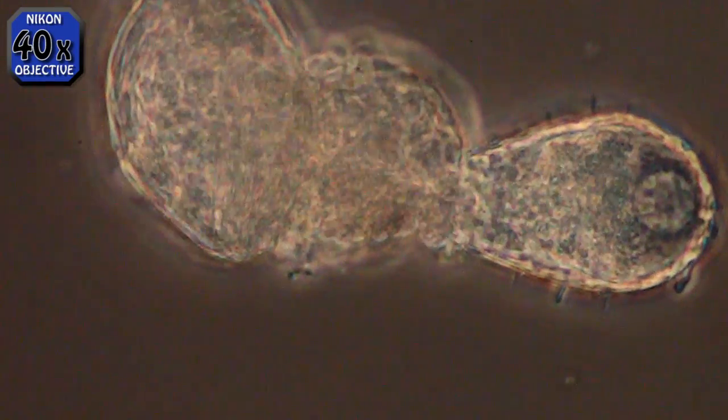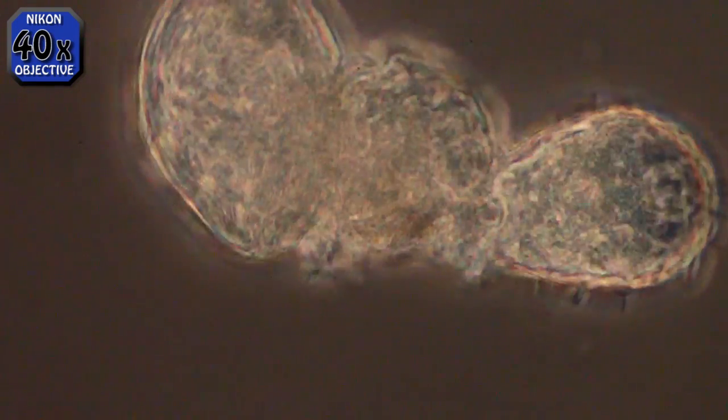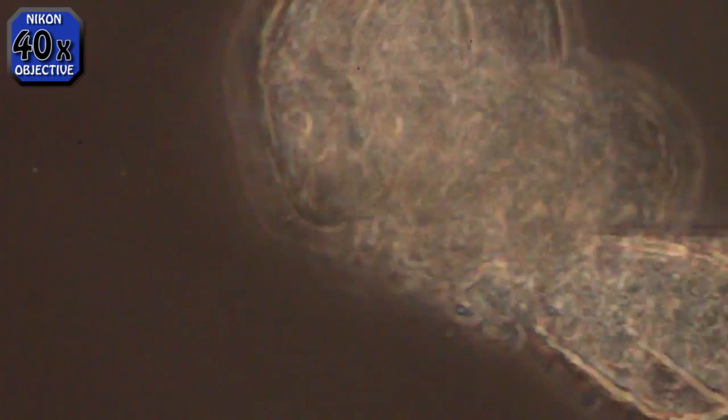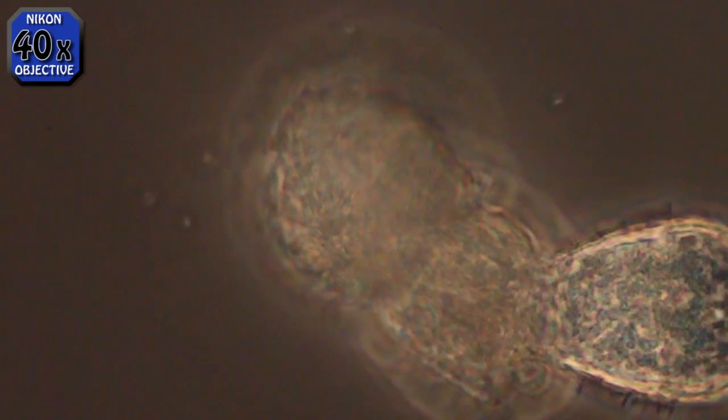You can see the stuff inside of him moving around. I don't know what that vacuole-looking thing is on his far right rounded end. I did it this way to show that he is moving. And now here we are at normal speed.